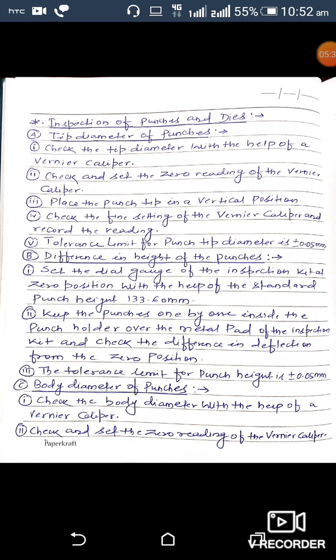Our next topic is inspection of punches and dies. First is inspection of tip diameter of the punch. To check the tip diameter, use a vernier caliper — check and set the zero reading, place the punch tip in a vertical position, check the fine setting, and record the reading. The tolerance limit for punch tip diameter is plus or minus 0.05 mm.